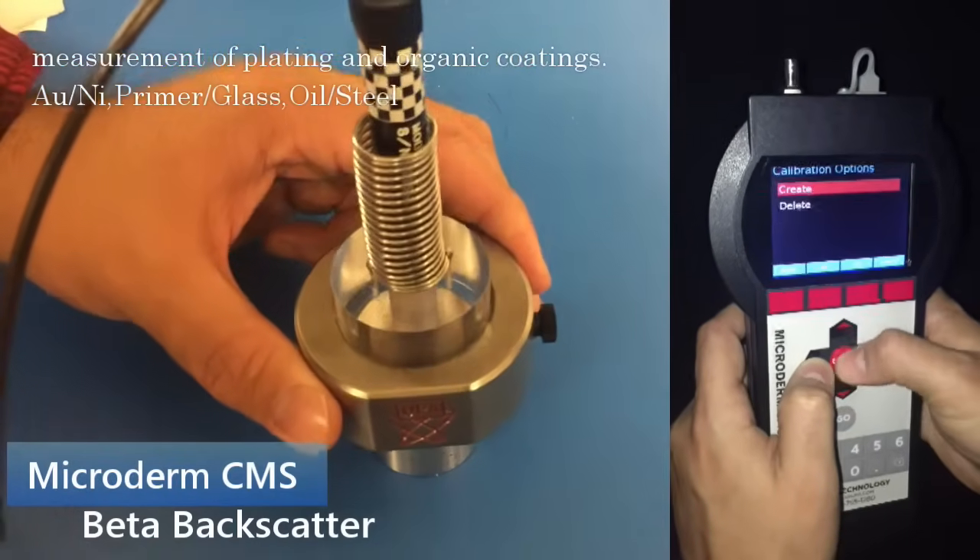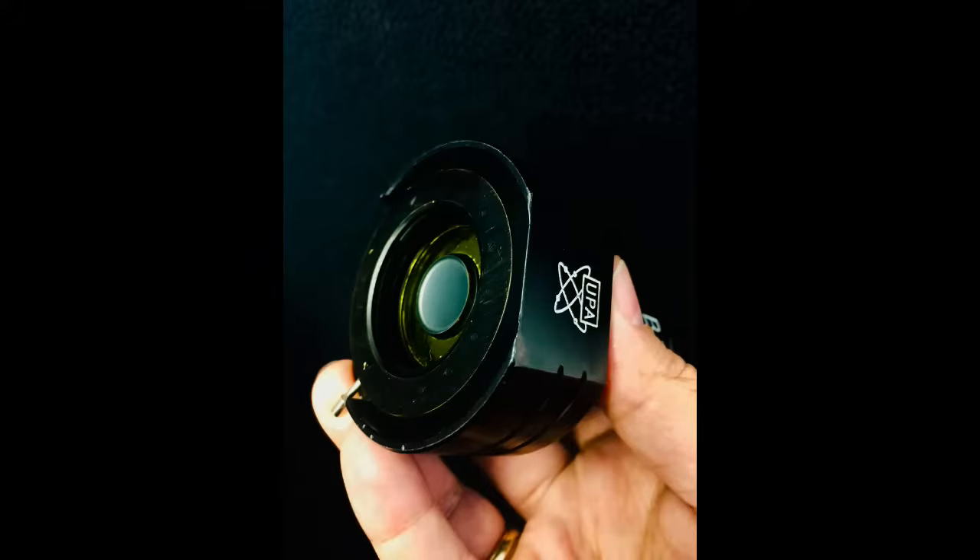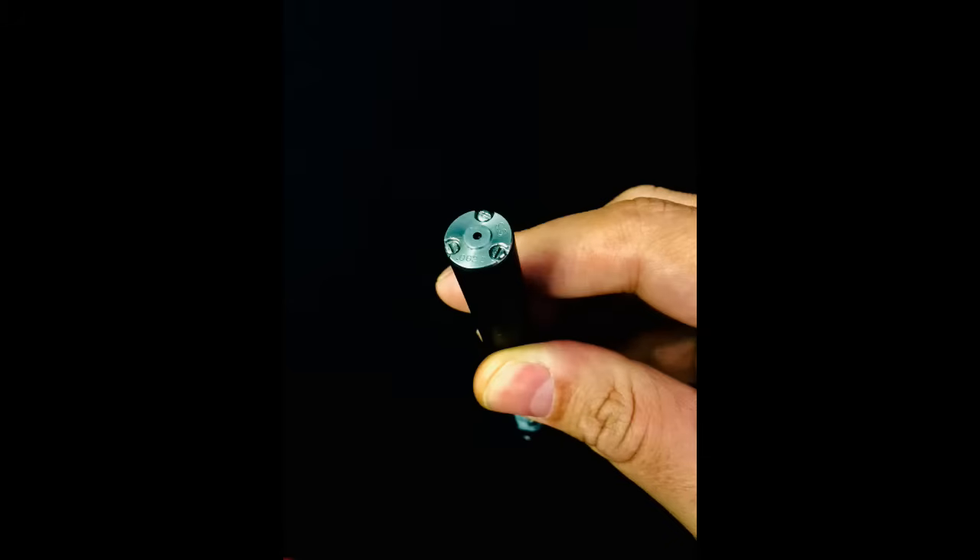UPA is more than a supplier — we are your coating measurement partner. UPA beta sources can be used with all brands of beta instruments and probes. Replace older decayed beta sources with new ones to improve accuracy and shorten measurement times for your applications.